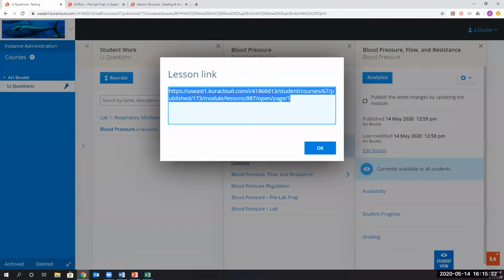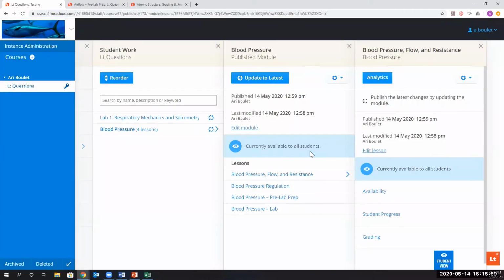All right, so before moving on to new features, we do have a question that says, can we include our own example data? Is there a way to save data and import it as data that can be analyzed for the students? So this is definitely possible, Kristen. Thank you for your question. If you were to use LabChart, you'd be able to save that as a settings file from LabChart, and you'd be able to record your own example data that way.